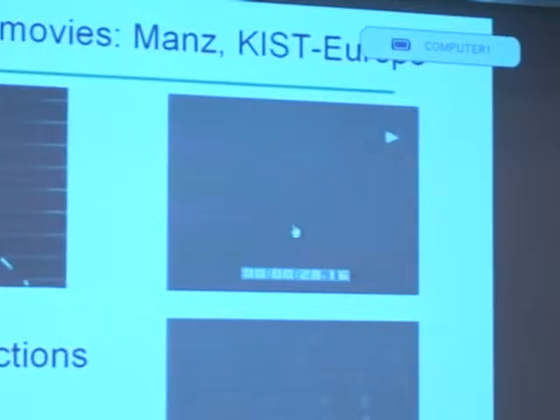And this is another example of a parallel injection. And we've got a little focusing going on. And here you can see the fronts moving, and you can see the separation of the different components inside the channels. And you saw the onset of them getting divided up into those channels.